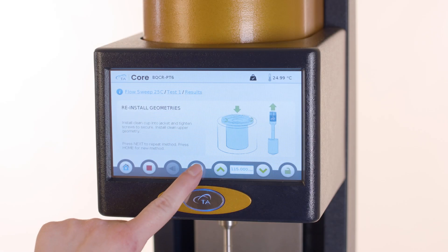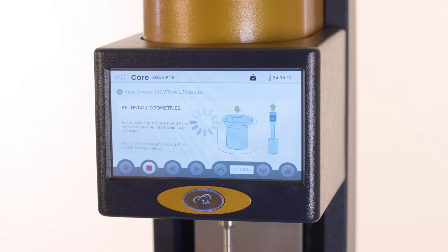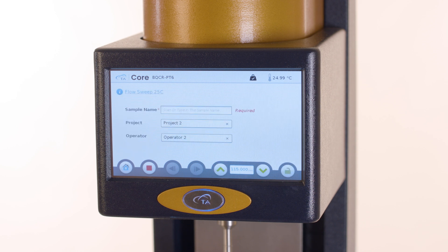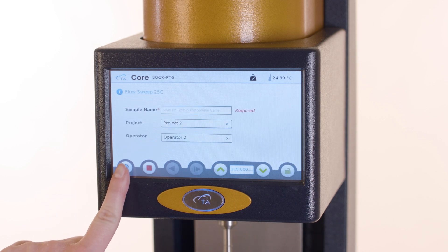After the geometry barcode is read by the system, press next to repeat the same method, or press home to select a new method.